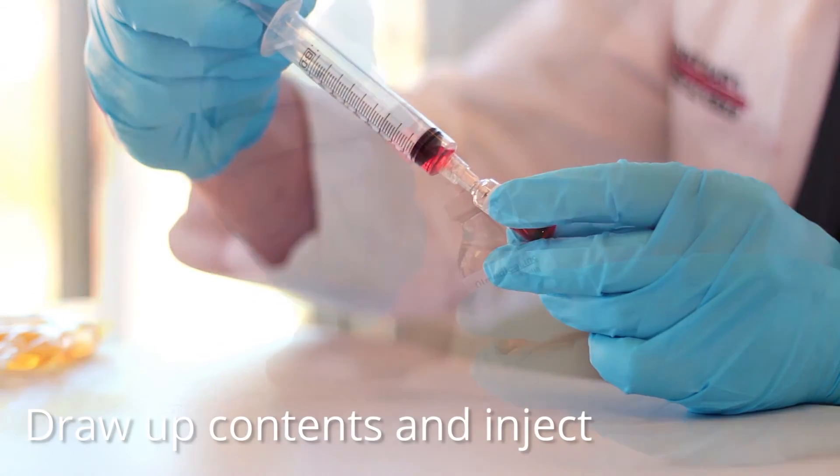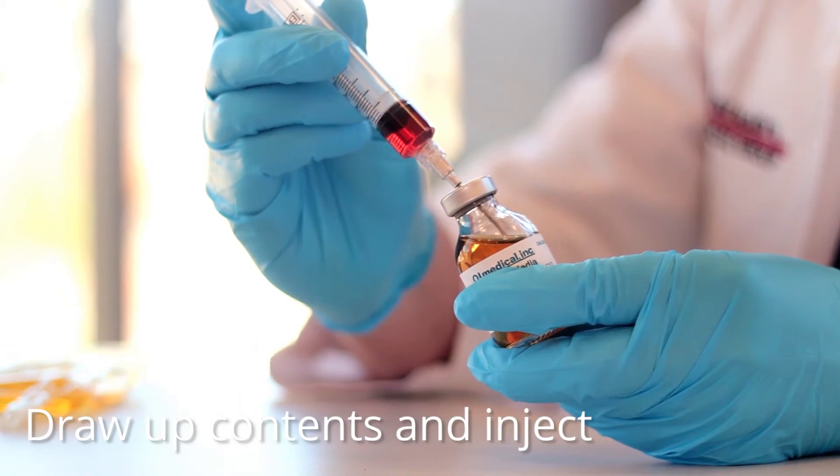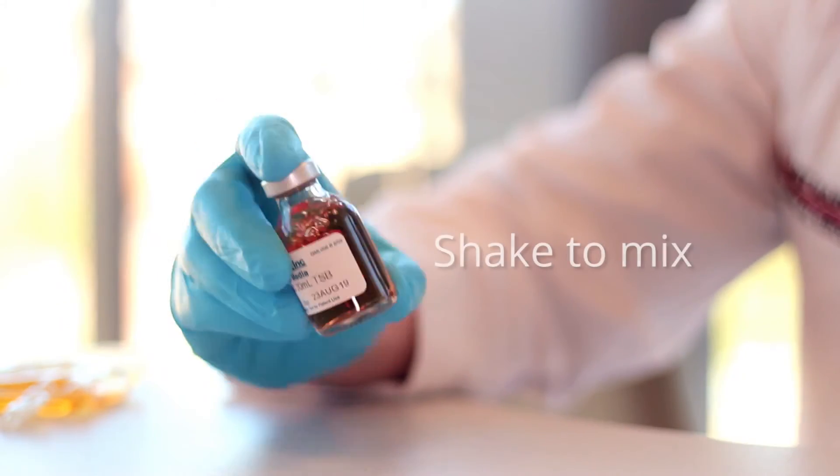Draw up contents of the ampoule and inject into the GrowMed vial. Shake to mix indicator dye.